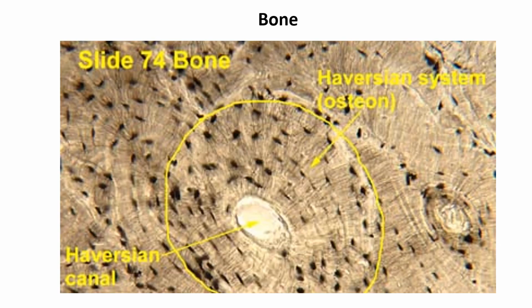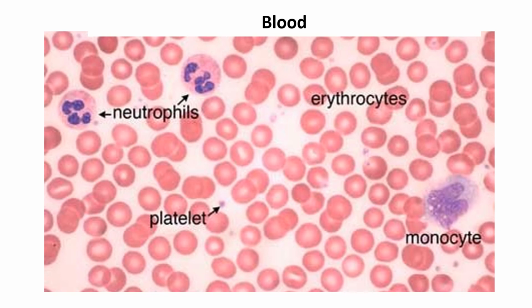And then here we have bone. Just mention it here because it's one of the connective tissues. You cover this in the skeletal system. And then here we have blood. Now, blood has 3 different types of cells. It has a platelet, this little tiny spot right there. Of course, the red blood cells themselves, lacking a nucleus, donut-shaped cells with a little depression, so it looks like they have a hole, but they actually don't. And then we have the white blood cells, which have got nuclei. But you cover this again when you talk about the blood system.